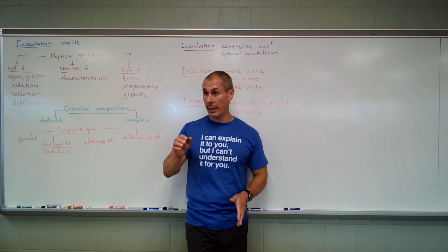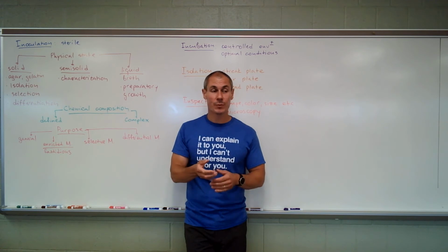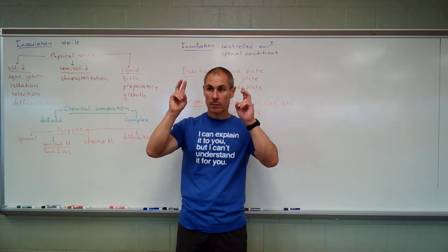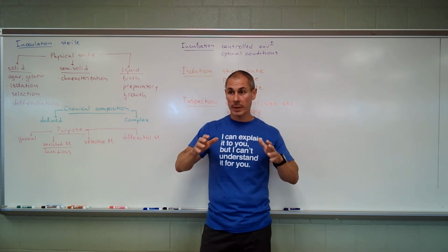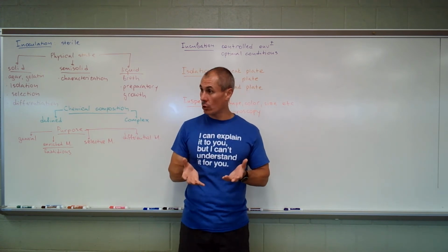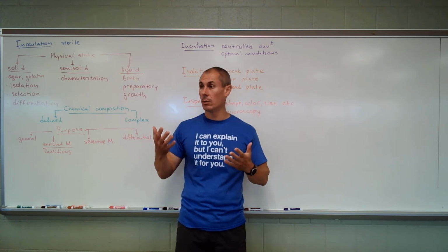Couple of things that I want to highlight. So DIC, differential interference contrast, makes fake 3D sorts of live images. Confocal produces almost a 3D image. Here's how. It takes slices of the specimen, optical slices. You see what I'm saying? So in confocal microscopy, like in CT scan, the microscope takes multiple pictures at different angles, combines them in the software, producing a 3D image of the specimen. Does that make sense?